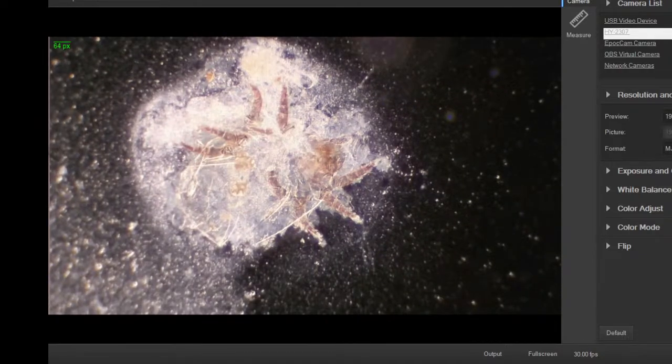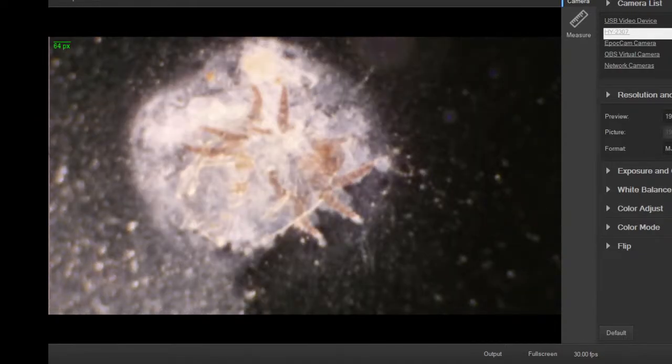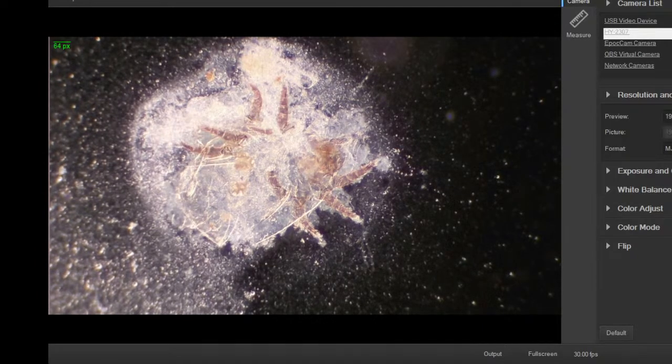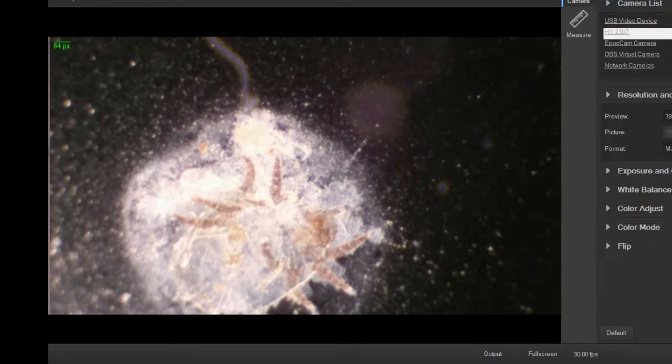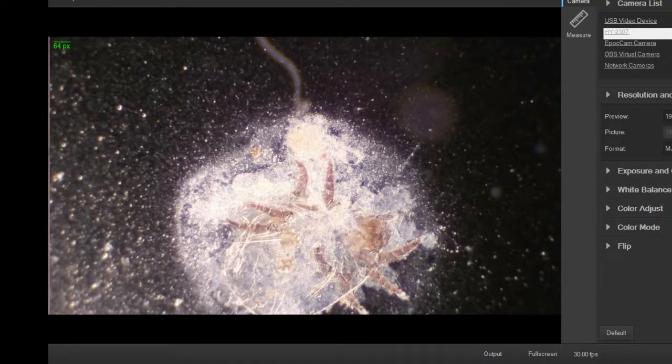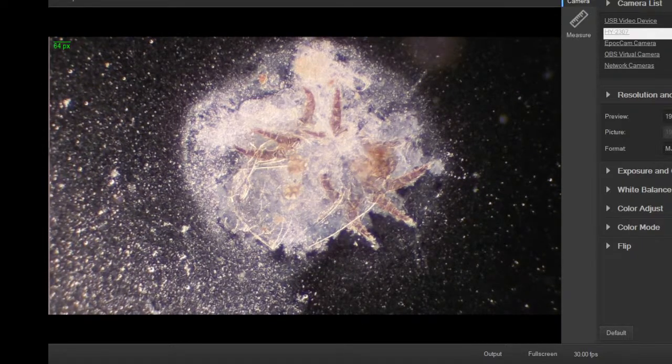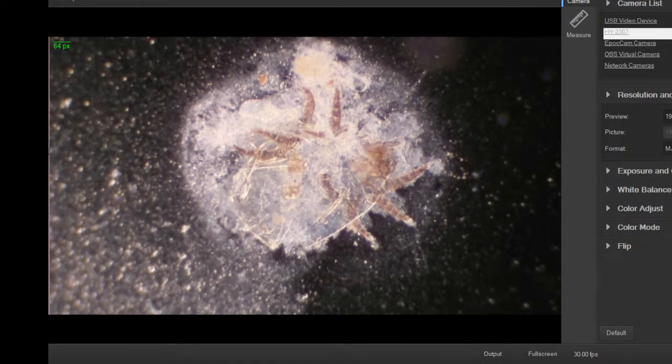So my technique was definitely flawed. I should have used a depression slide. It has a little bit of a dip in it, where you have a little more water volume. I put too much pressure on the dead mite and squashed it. But you can see the legs pretty well here from the underside. The legs are still in the same orientation as they were.